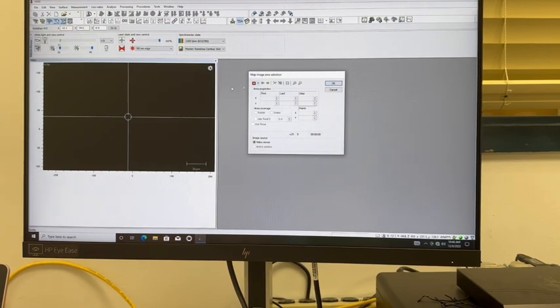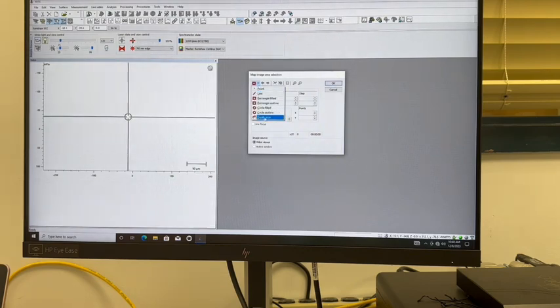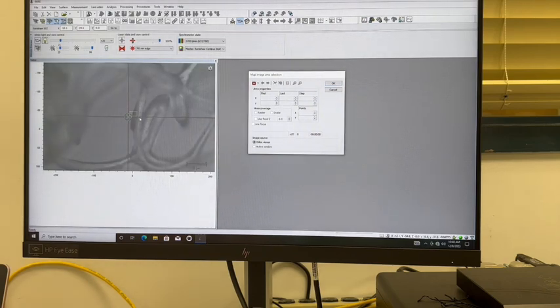The next feature we will cover is mapping spectral acquisition. This will take multiple Raman analyses across a specific area of your sample. To do this, you first select the shape type that you would like to use. For the purposes of this tutorial, I have chosen a rectangle filled. After you have selected the shape, you can then draw the shape over the video viewer and select the area that you will take the measurements for.